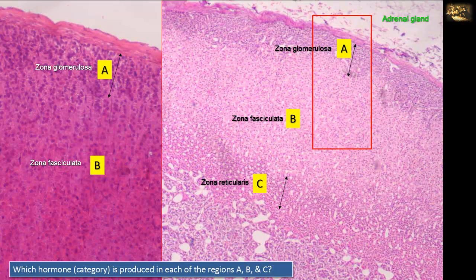Zone C is formed of small cells arranged in irregular cords, like a reticulum or a network, hence the name zona reticularis. The cells of the three zones, especially zona fasciculata, have a pale foamy appearance of the cytoplasm because the cytoplasm is rich in lipid droplets, which are necessary for hormone synthesis. The hormones are mineralocorticoids such as aldosterone from zona glomerulosa, glucocorticoids such as cortisol from zona fasciculata, and sex hormones such as androgens from zona reticularis.